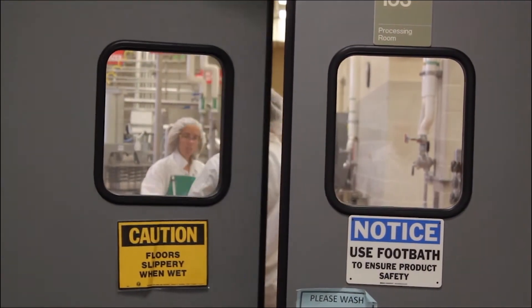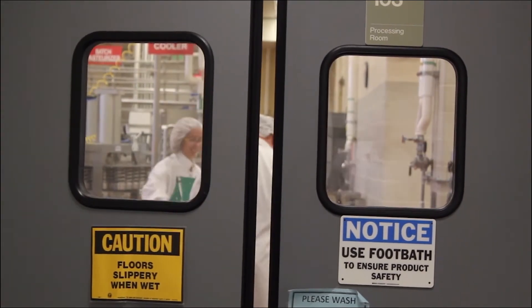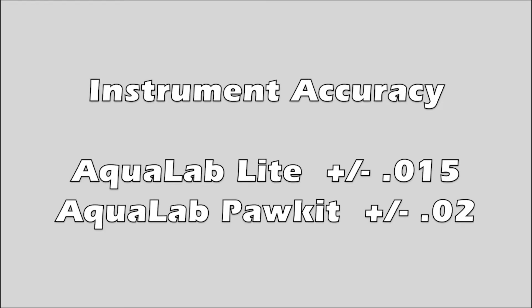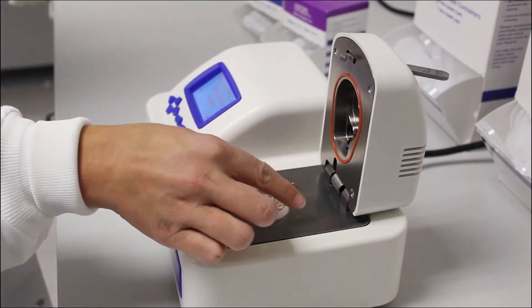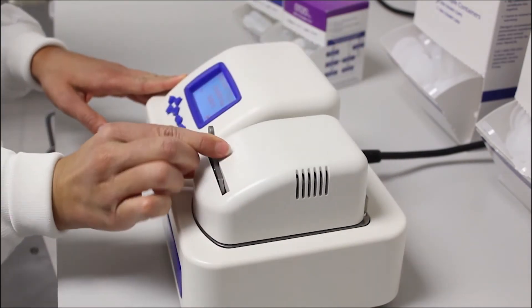This is because of the accuracy of these instruments and other limitations. The light measures water activity to within plus or minus .015 water activity accuracy, and the pocket measures to .02. The light and the pocket use capacitance sensors, which are not the most accurate sensors for measuring water activity. The most accurate method for measuring water activity is the chilled mirror dew point method.